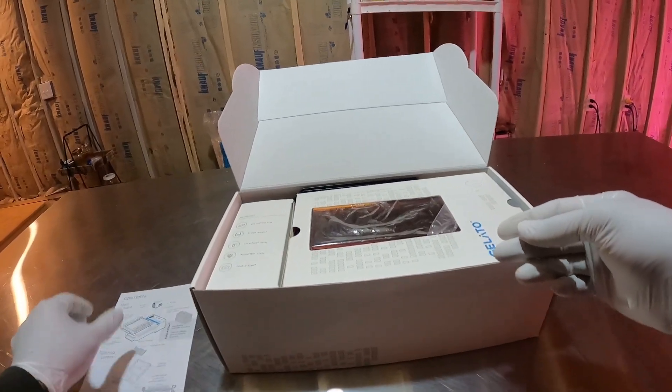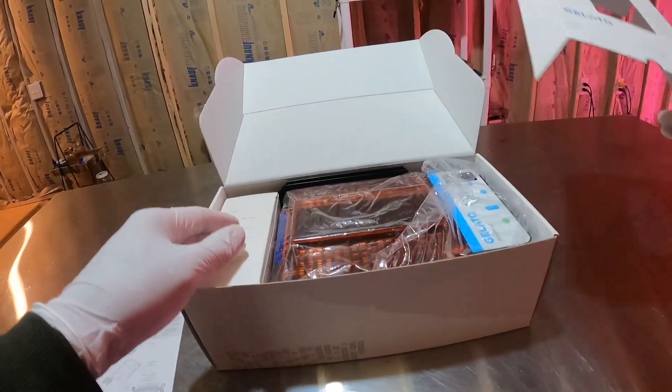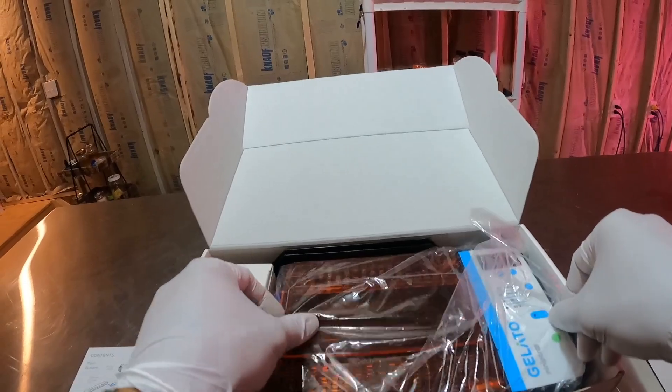So as soon as you open up the box, you're going to get your little instruction pamphlet — super user-friendly, just as I mentioned. And we're going to get right into the meat of things here and grab the Gelato System.